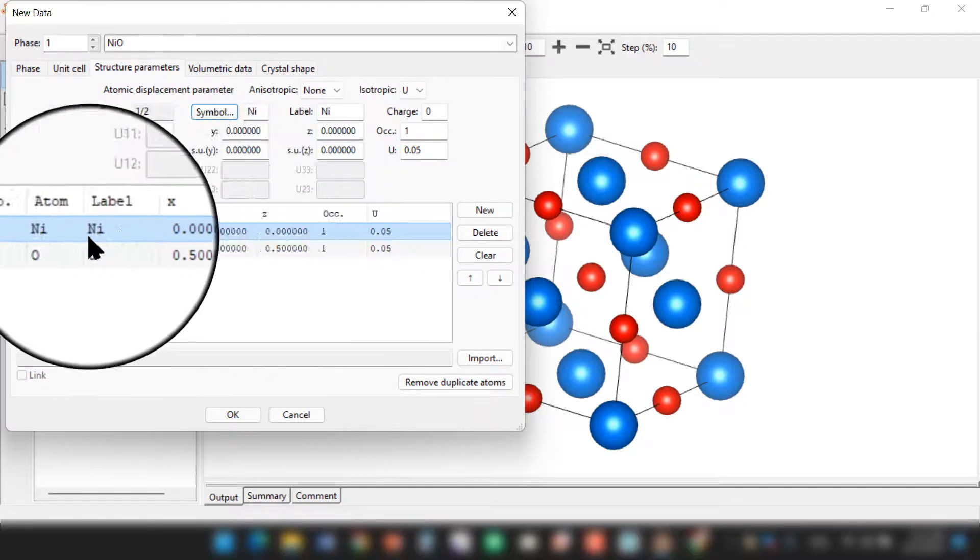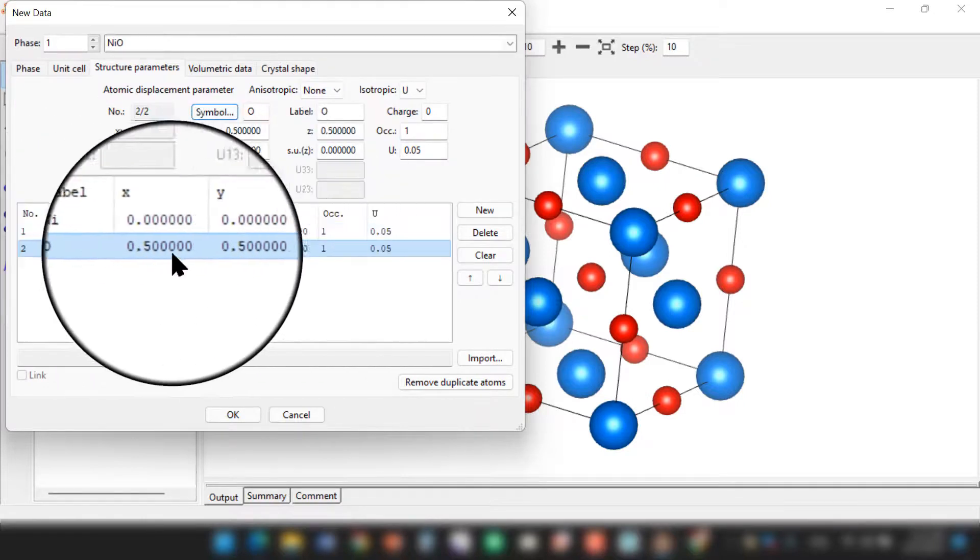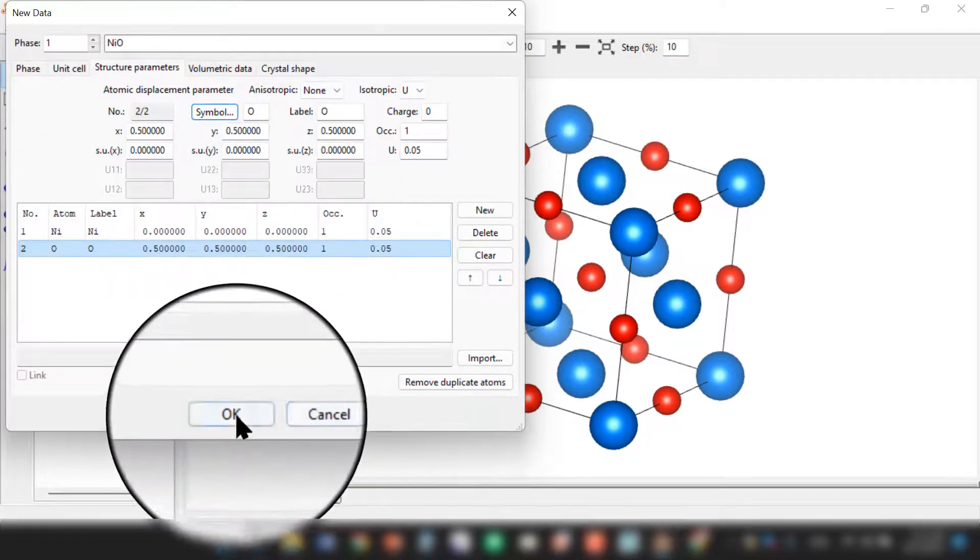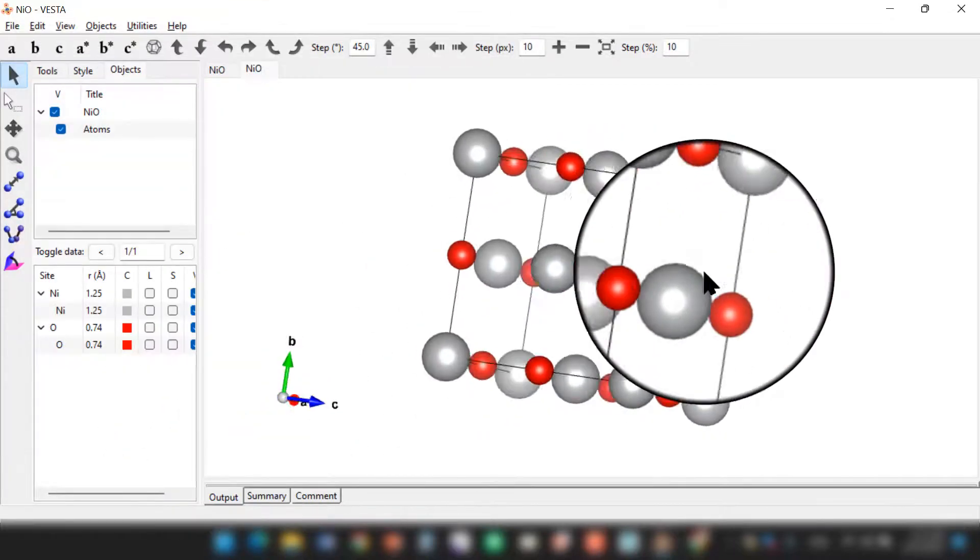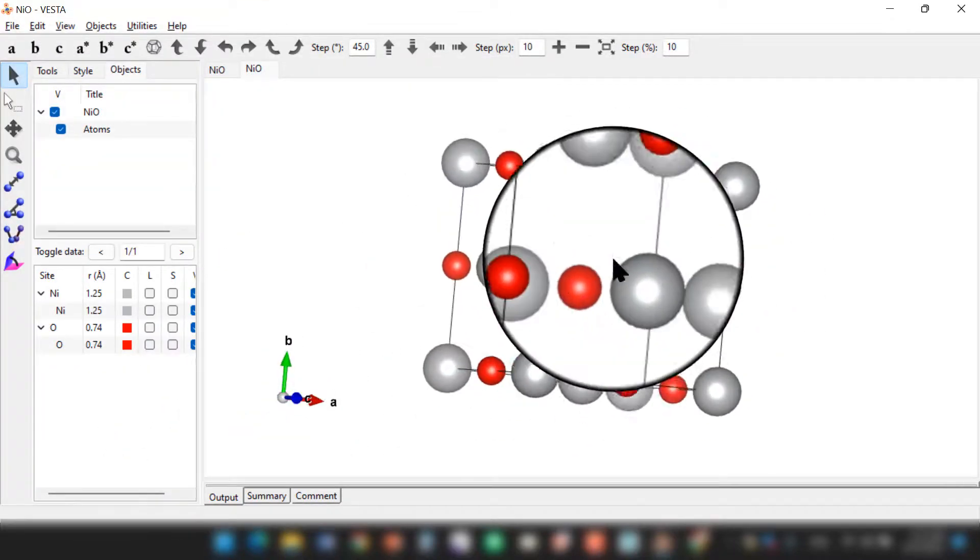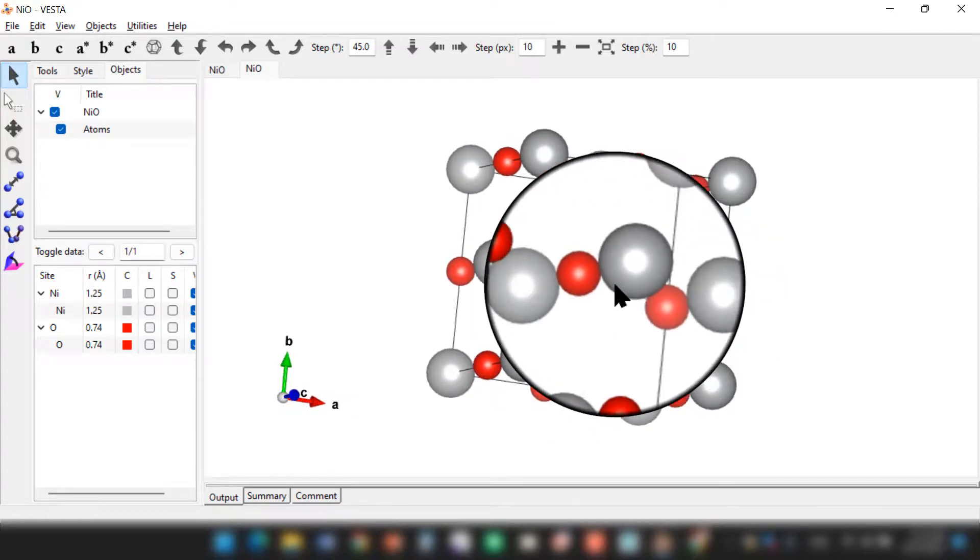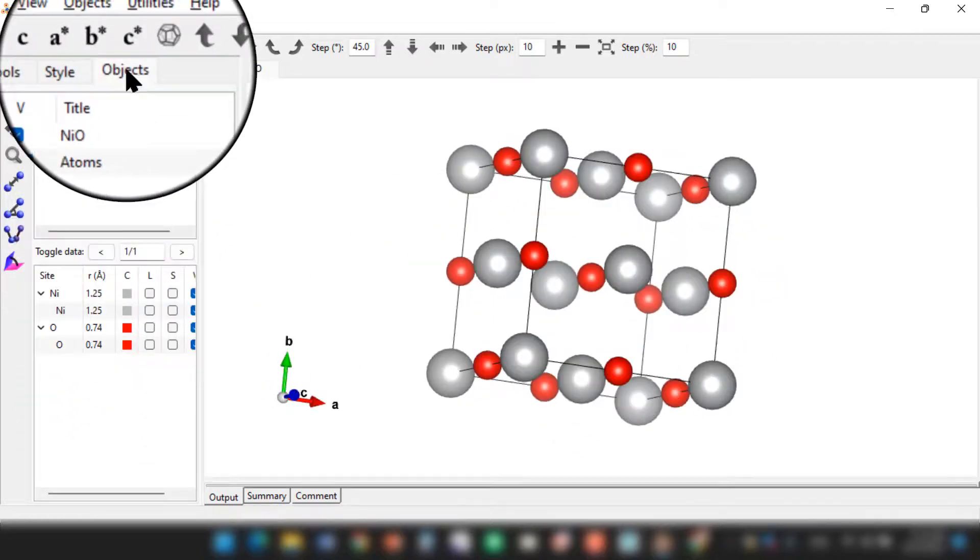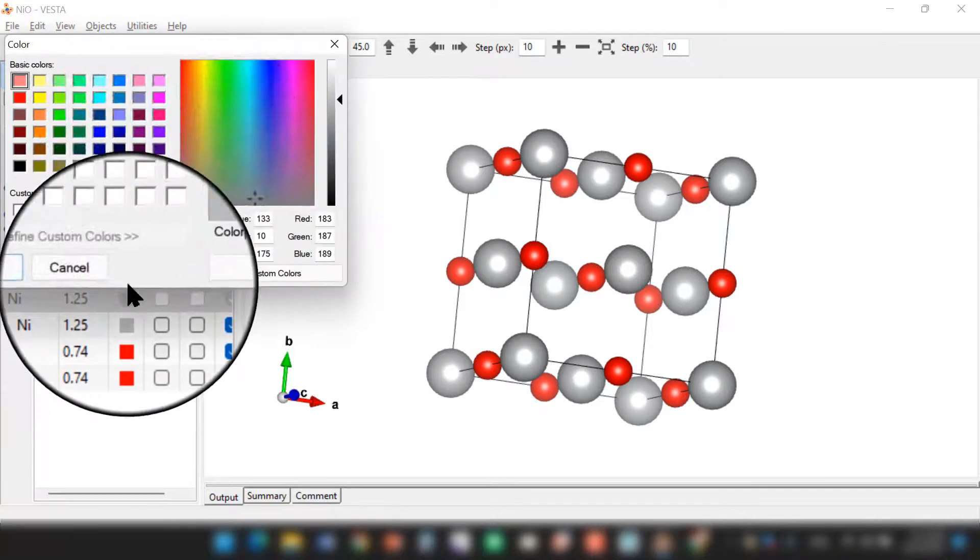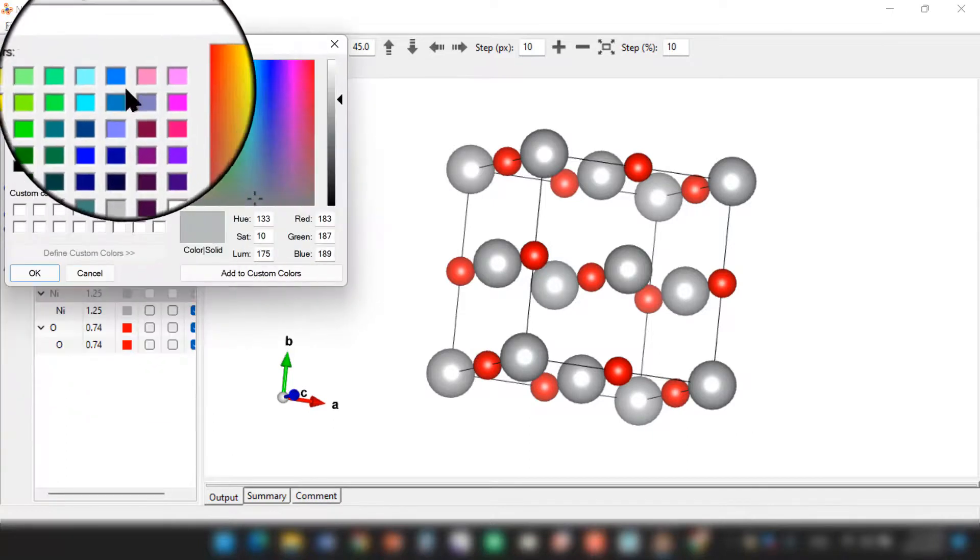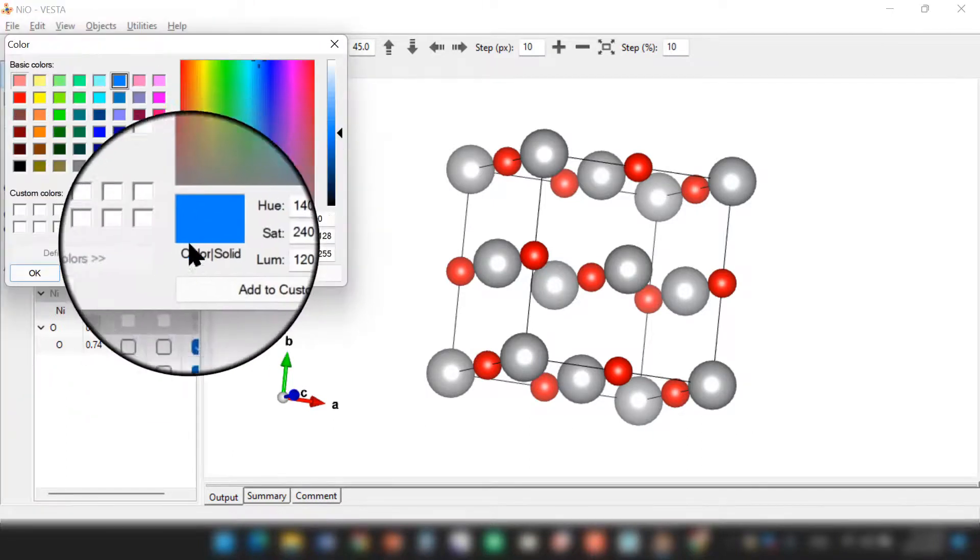So you can see you have nickel at 0, 0, 0 and the oxygen at 0.5, 0.5, and 0.5. Just click OK. So you got your nickel oxide structure here. If you want to change the color of any atom, you can see over here in the Object menu. Nickel - you can change the color to any color you like, so for example blue.